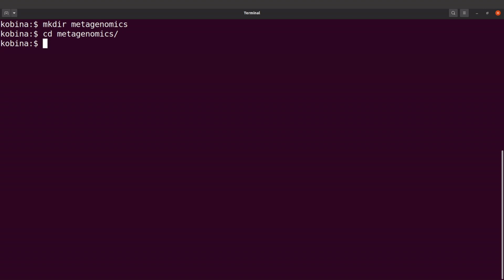And then I'm going to create two files. One of the files will contain the download links, and the other file will contain the commands we are going to use to download the files. So I'll first create a file, and in this file, I'm going to paste the download links. It's a normal text file. Okay, so that means I'll have to open it.